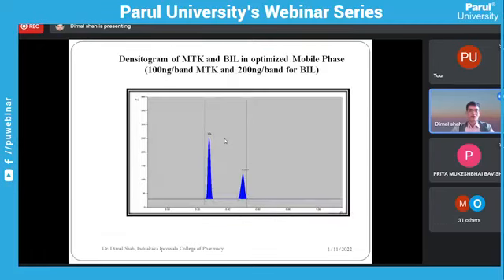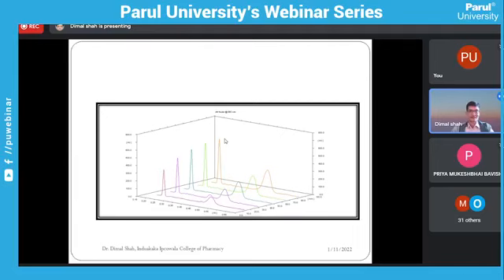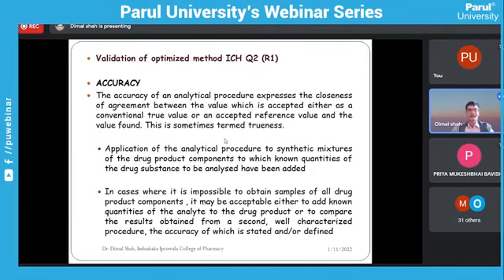So that is about the force degradation studies and the steps that we should consider, or take care of, while developing an HPTLC method. I will not go into the validation aspect, because it is a totally new topic and a new concept which requires more time.